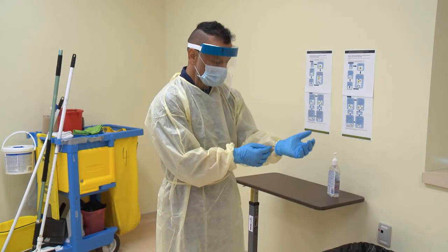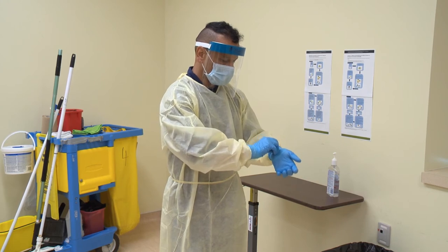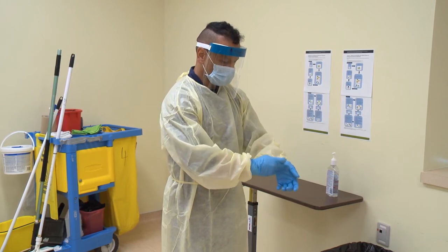Always remove your gloves first, as they are considered to be the dirtiest and most contaminated PPE you are wearing. The glove-to-glove method will be shown now.